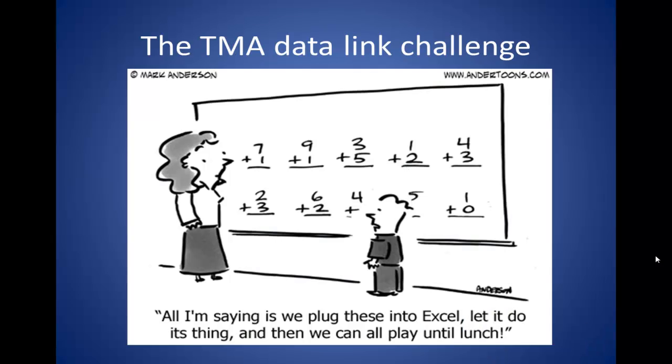And we're going to give you an example of how to deal with a tissue microarray data link challenge. And that is how do you link your tissue microarray with the original samples. Here's an example of a young man who says there's usually a better way of doing this. Instead of using Excel, let's go ahead and plug these numbers into Freezerworks, and then we can play until lunch.